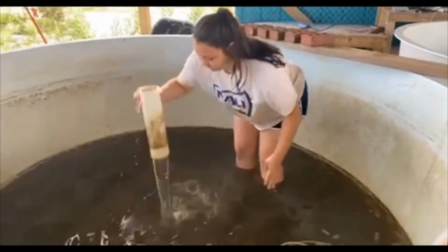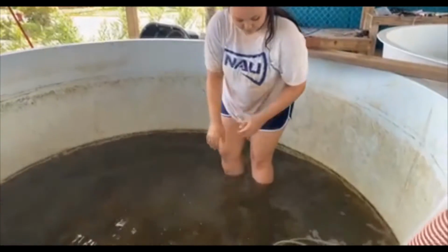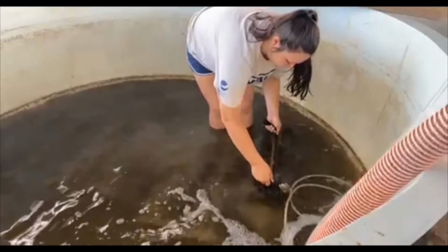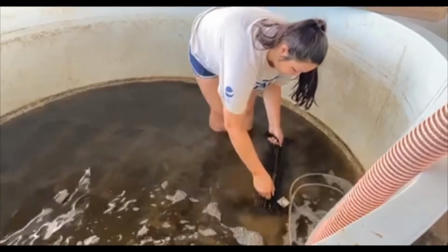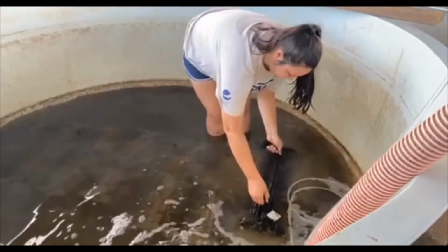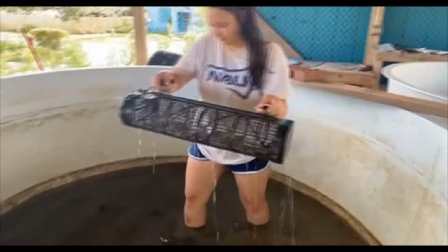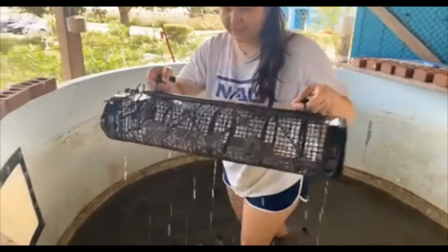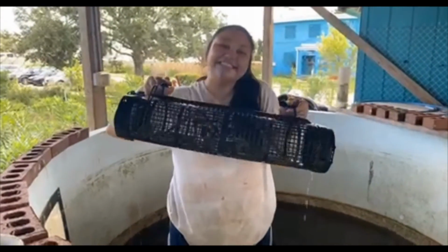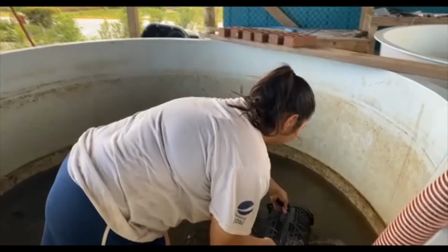A typical day in the lab will begin with the oyster shake. Every morning, these mesocosms are drained. The cages holding the oysters are gently rinsed, and the mud is pushed down the drain. The bricks underneath the cages are set straight. The cages are rotated to provide each equal opportunity exposure to the food source, and the tanks are refilled. Once the cages are submerged again, they lie in wait for the afternoon shake. The tanks are not drained or rotated in the afternoons, only shaken. This is done twice daily to prevent the oyster larvae from suffocating.